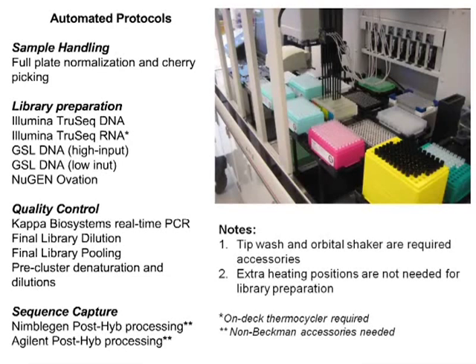On the quality control side, which is certainly more ubiquitous, I mentioned some of these: Kapa Biosystems real-time PCR, final library dilution and pooling, and then finally the pre-cluster denaturation and dilution steps prior to materials going on the Illumina sequencer.